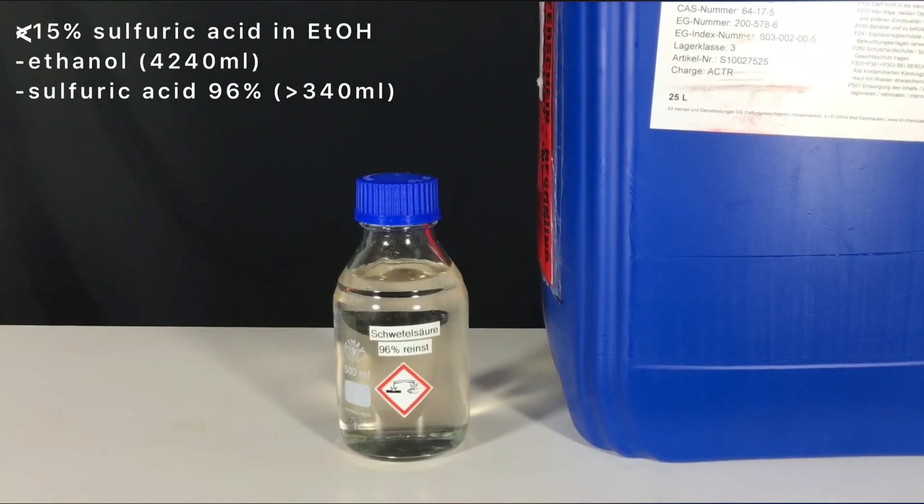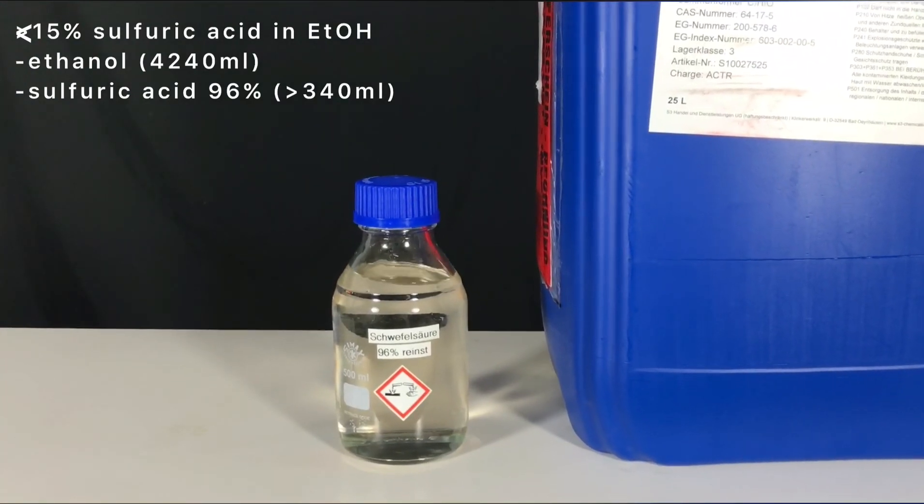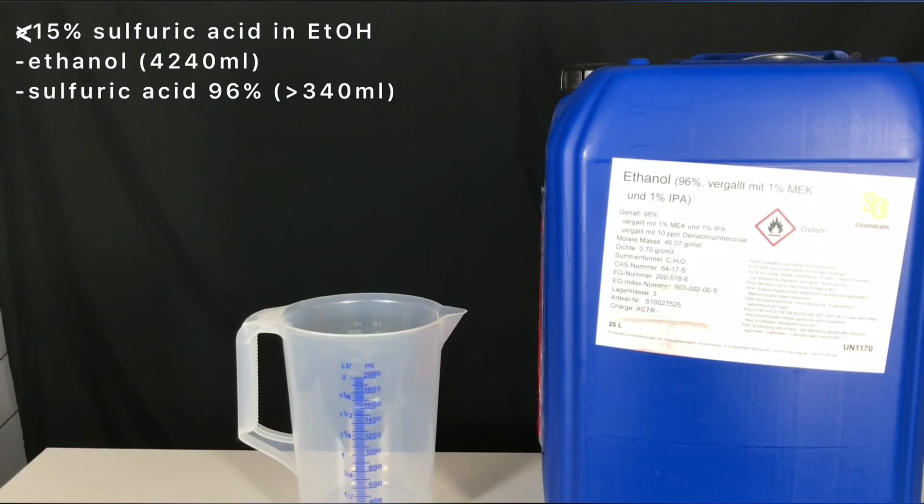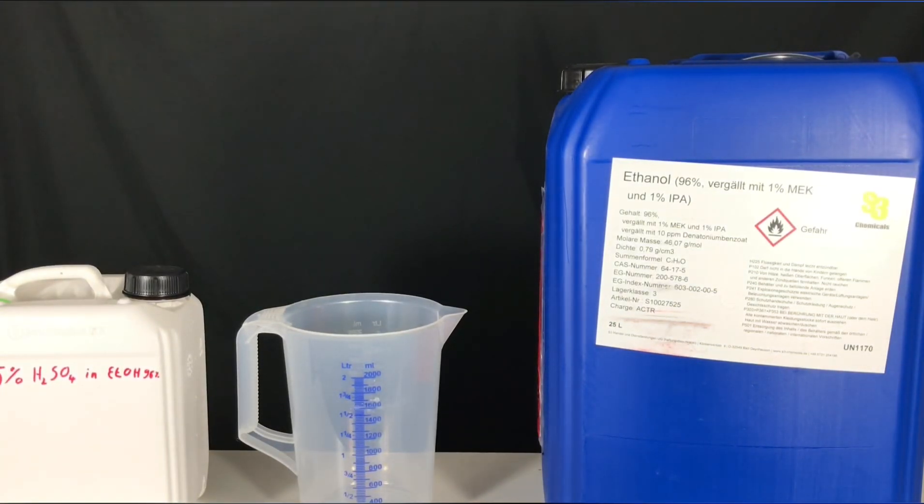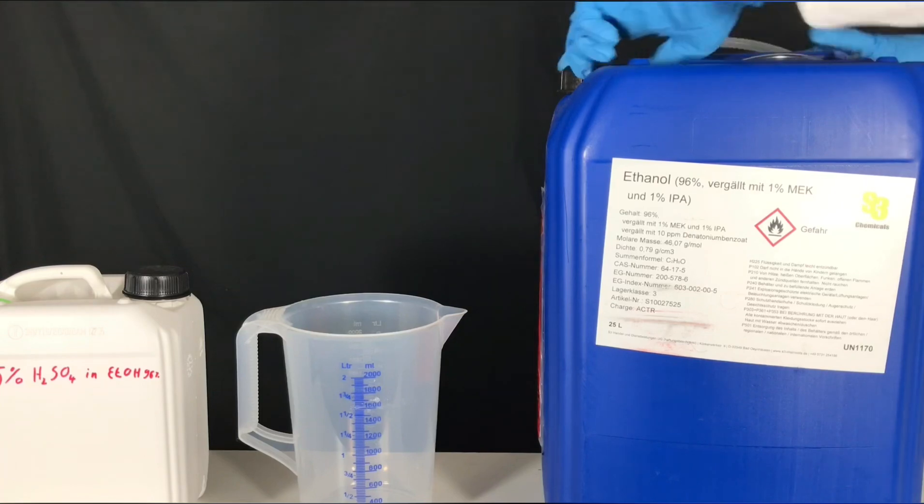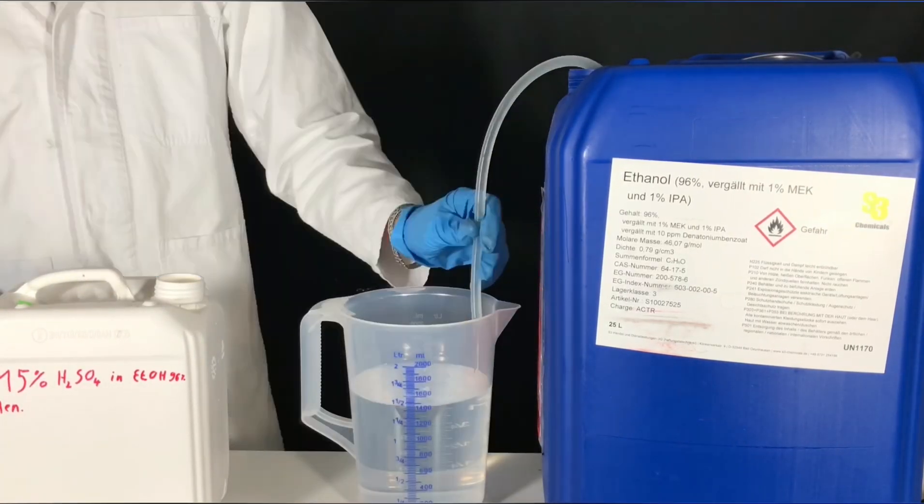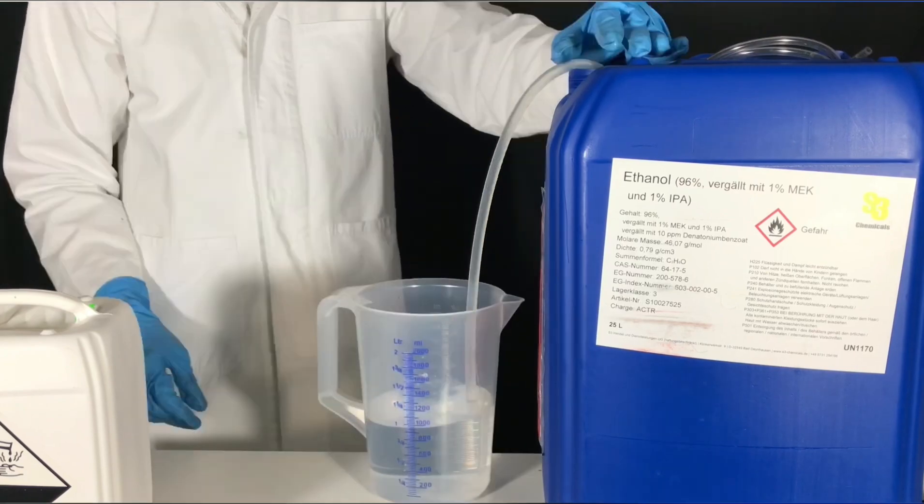For a solution containing a little less than 15% sulfuric acid in ethanol, 4.24 liters of 96% ethanol are mixed with 340 milliliters of 96% sulfuric acid. The ethanol was transferred to a measuring cup using a silicon tube as a siphon.